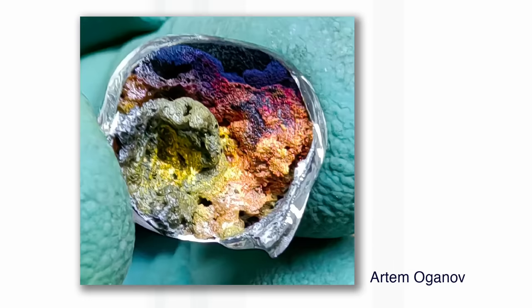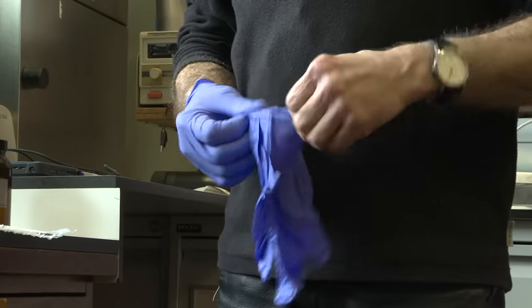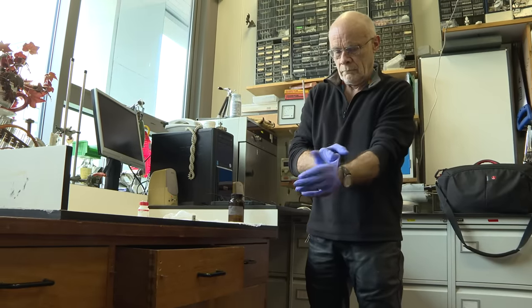Our Russian acquaintance, Artyom, who likes to do chemical experiments for his children in his basement, sent us photographs of a reaction that he had done with tungsten trioxide and metallic sodium, heating them up in a test tube. As you know, Neil loves sodium, so how could we resist?